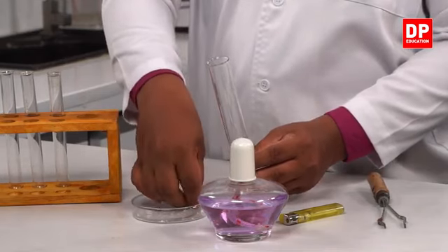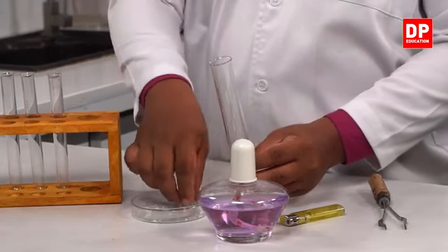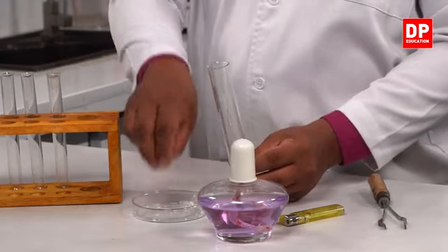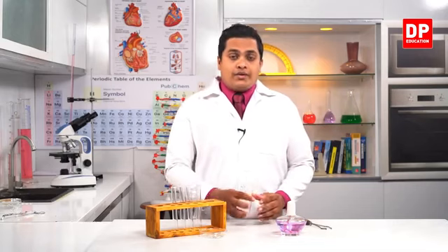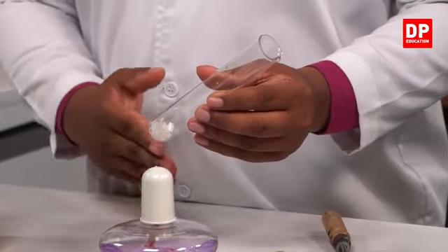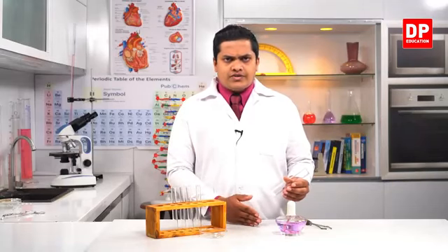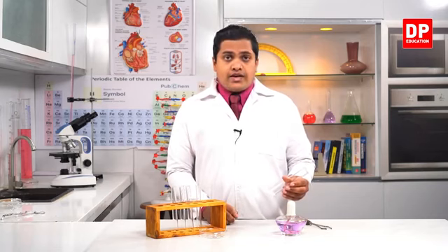When I heat this solid wax, you know that it will turn into a liquid. The solid wax will turn into a liquid, meaning the solid nature is getting changed into the liquid state. So we'll carry out the experiment to get the relevant observation.